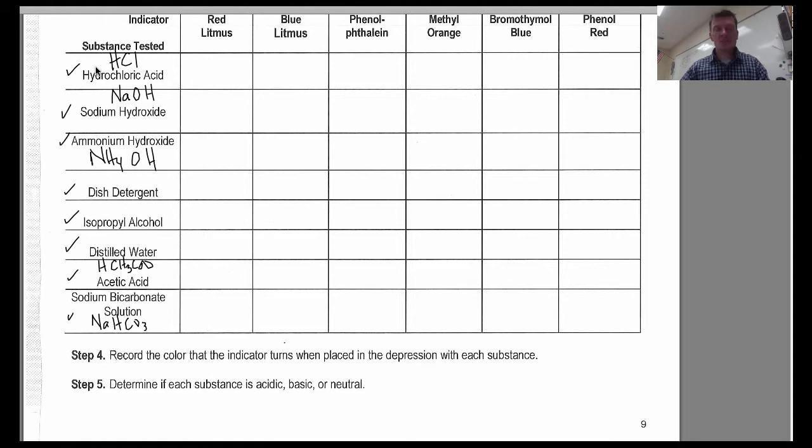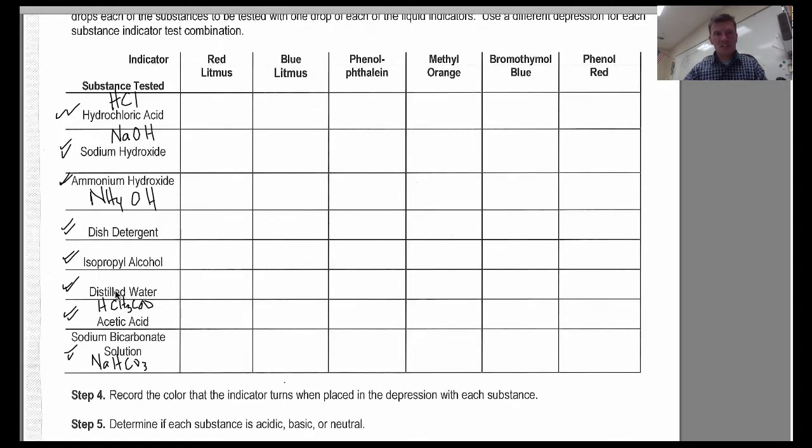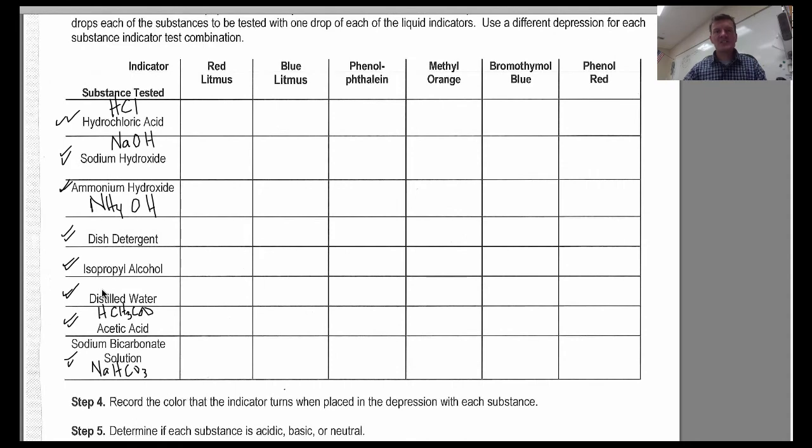And we're going to take these, how many we got here? 1, 2, 3, 4, 5, 6, 7, 8. 8 different substances, and we're going to test each of these with different indicators. And we'll talk about what these indicators do and what color they might turn based upon whether these are acids or bases. So we're going to test it with what's called red litmus paper. It's paper that is coated with a chemical.